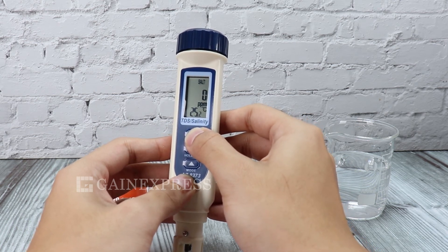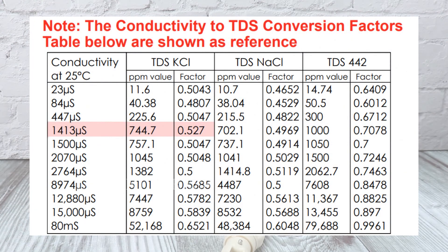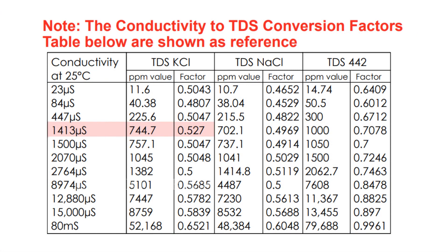The TDS factor needs to be adjusted for different calibration solutions. Always check the TDS factor conversion, then press monitor.